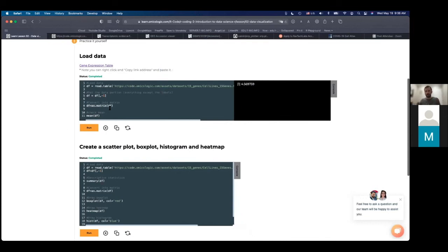So what's the average, or the mean, for our expression values? This is a very simple step. You can do this exercise for a given data set. Now, I can change this data set, right? I can take another data set and check the same right here.